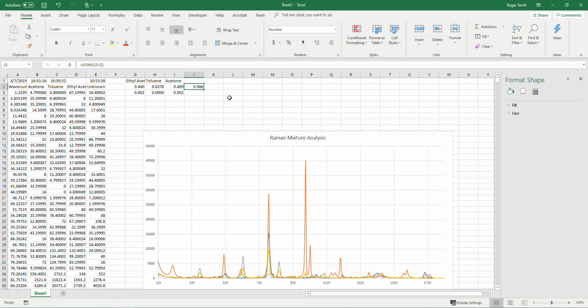So there is that. Now let us convert these guys into percentages. Okay, and we'll add a digit to them. Yeah, maybe add 2 digits. Yeah, there we go. That works. Add a couple digits to the percentages, right?